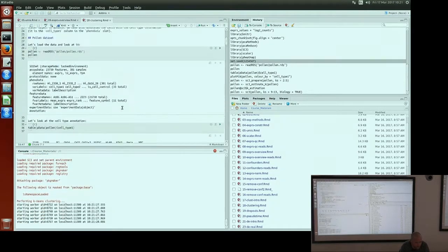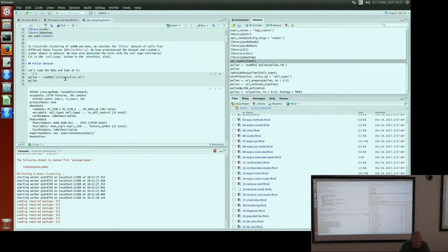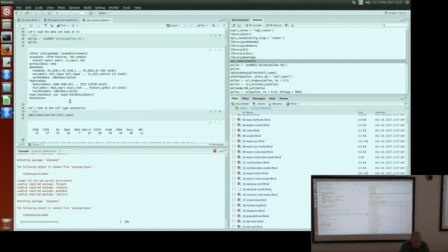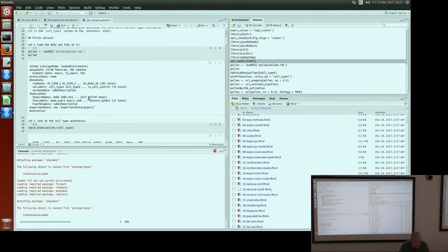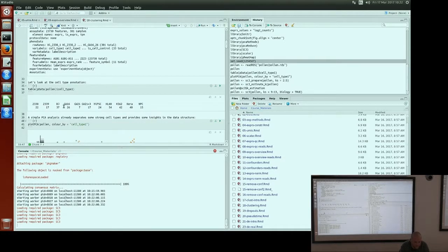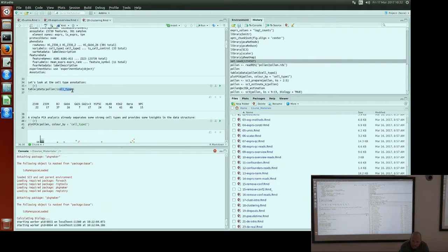Meanwhile, there was a question about the pollen dataset. The pollen dataset is 300 cells and 23,000 genes. The cell types that we look at were identified by the authors of the publication. We just rely on their knowledge and experience and say these are the ground truth cell types. We use them as the reference, and they are stored in the cell type 1 column of the SCATER object. Because they're stored in the object, you can visualize them. You can plot t-SNE, PCA, diffusion plots — many options in SCATER.